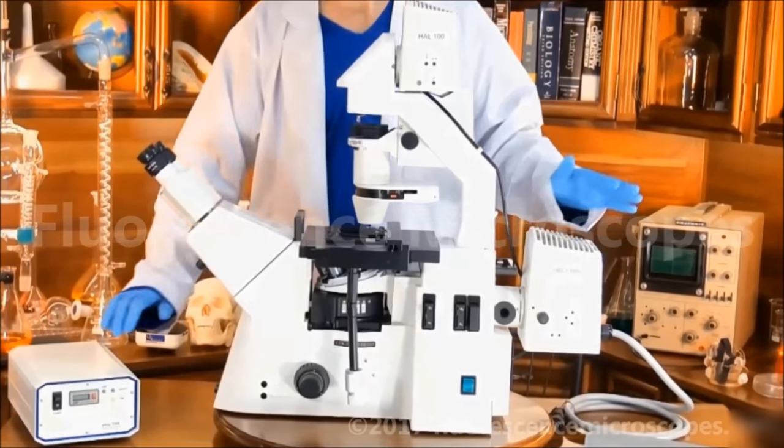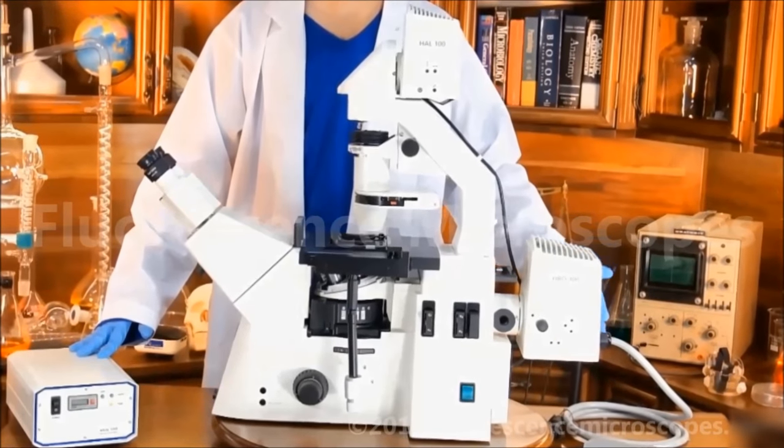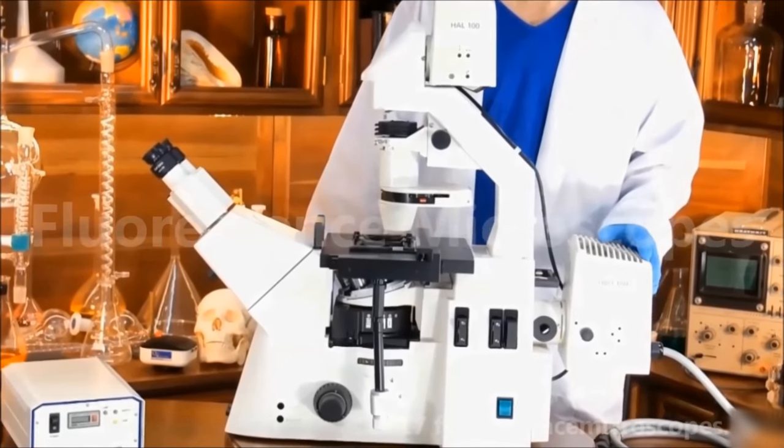If you would like to have a different illumination system rather than this mercury, we can configure an X-Site. X-Site 120, a metal halide system.